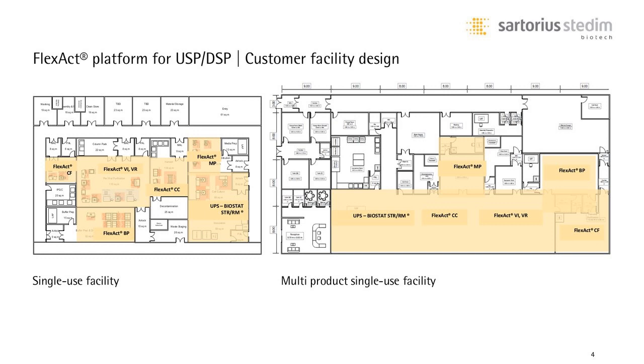So first, in regards to planning a facility, you really want to have a conceptual design. Again, going back to stainless steel, copy-paste from there, and you have your zoned rooms where you're piping liquid from a buffer prep into your downstream facility, or your media prep piping it into your upstream bioreactors. In that sort of sense, you're moving liquids over long tubing, flexible tubing lines.